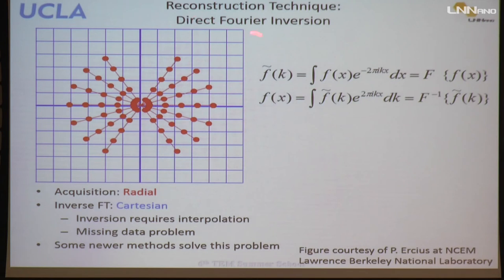And also, there's a lot of missing data. In electron tomography especially, you cannot measure many projections due to the dose limit. So a lot of actual data points are missing. We don't know them; they are undetermined. You cannot Fourier transform with a lot of undetermined points, because to get one point in Fourier space, you have to sum up every point in real space, and vice versa. So we have missing data, and we cannot even Fourier transform. I will explain later some new methods that can solve this problem. But right now, this doesn't work. So Fourier space is actually not working in the initial case.